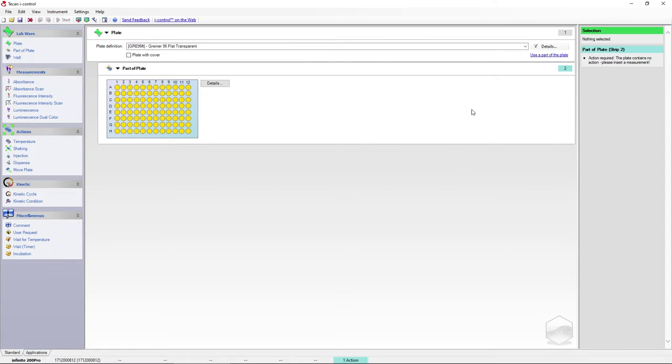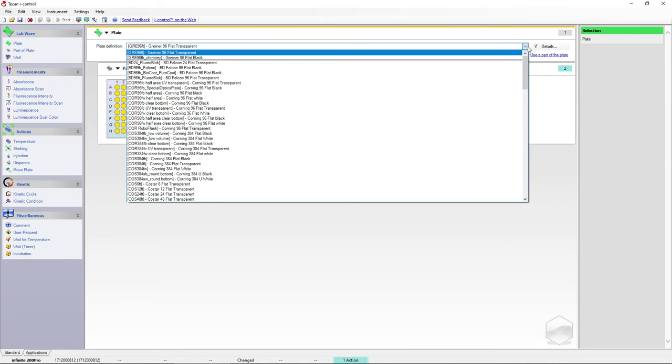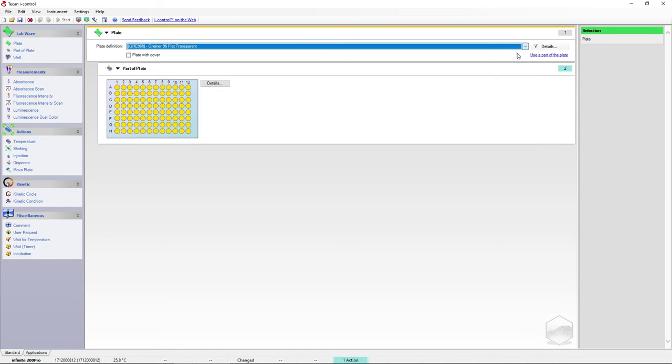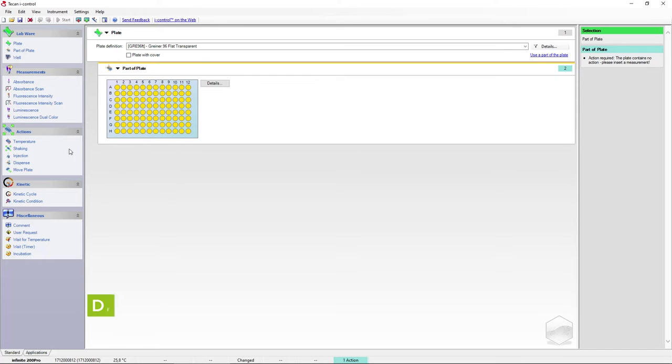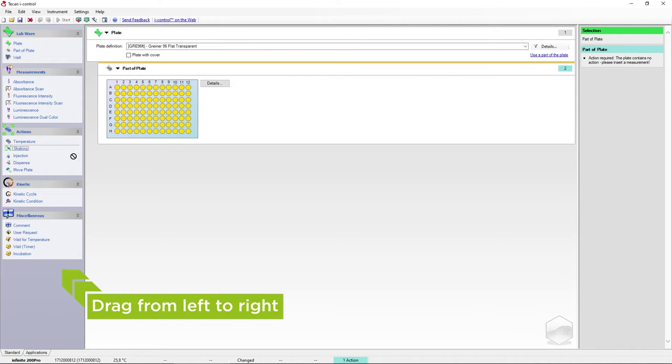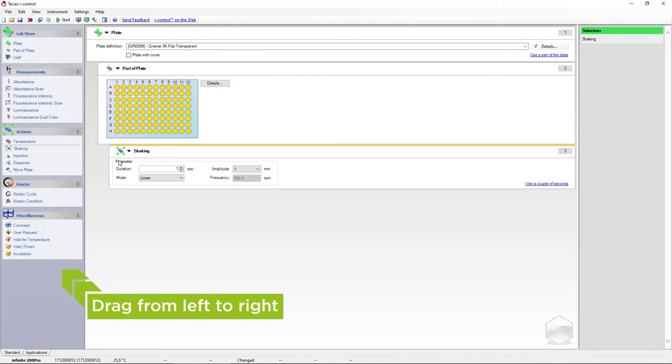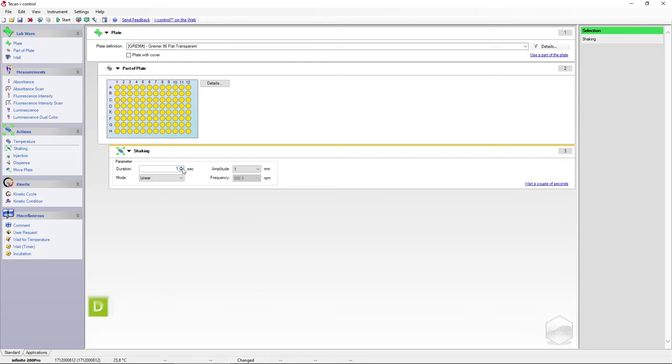First of all, we need to define the measurement parameters. Choose the correct plate definition for the plate you're using and the plate area you would like to measure. New actions can be added to the method by dragging and dropping from the menu on the left-hand side of your screen. First, we want to shake our plate, setting the desired duration and intensity.